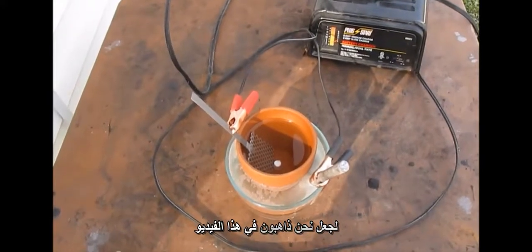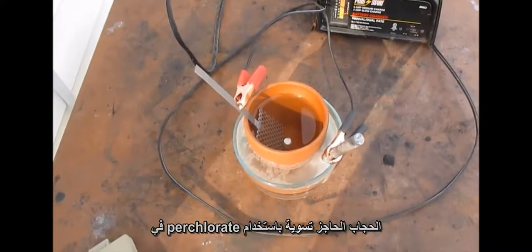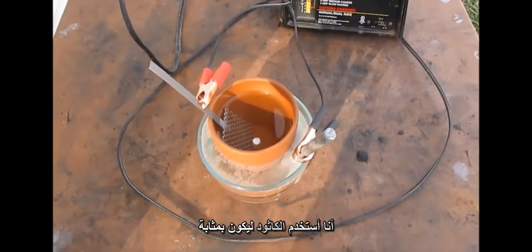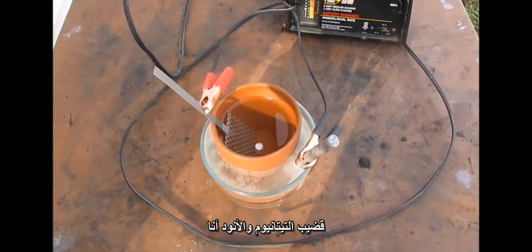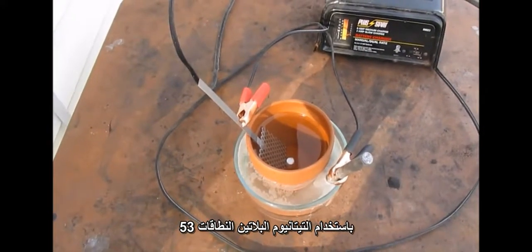In this video, we're going to be making sodium perchlorate using a diaphragm cell. To serve as a cathode, I am using a titanium rod, and for the anode, I am using a platinized titanium anode.